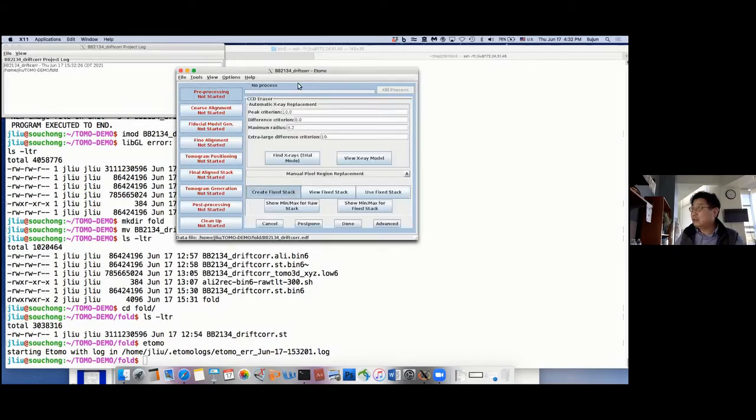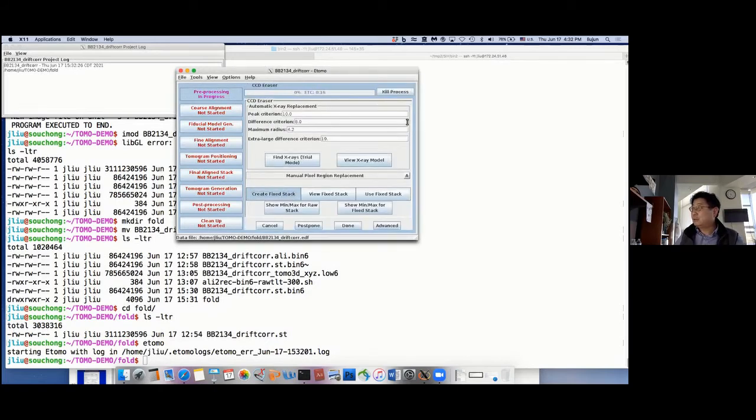They're all just very standard. You can pre-process them and follow this one. And because this data is already being analyzed, you don't need to fix all this. I just try to use 5 to 10 minutes to finish the alignment, so you can at least see the workflow. And they're all available online.